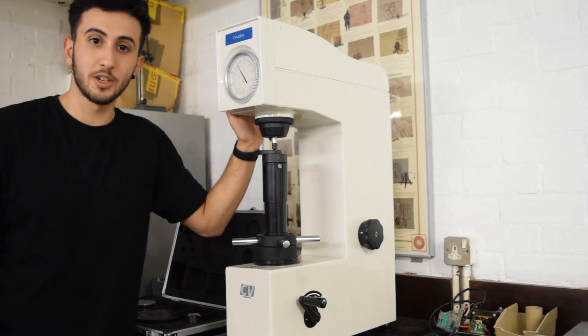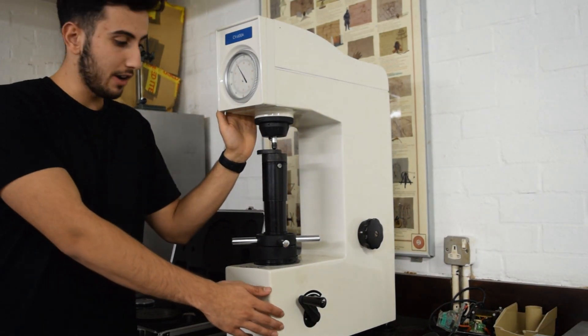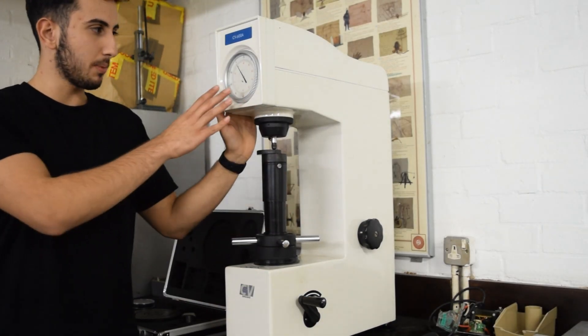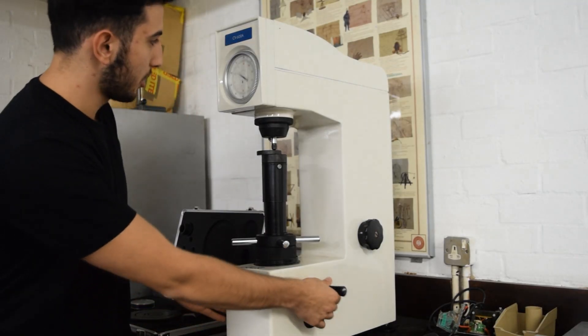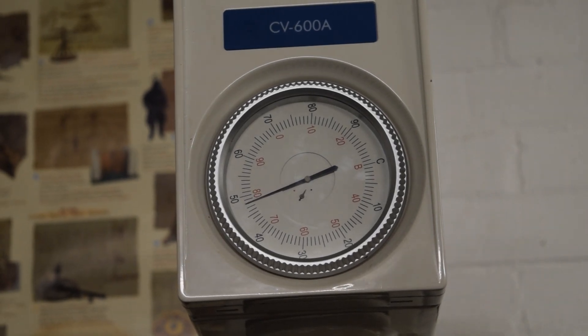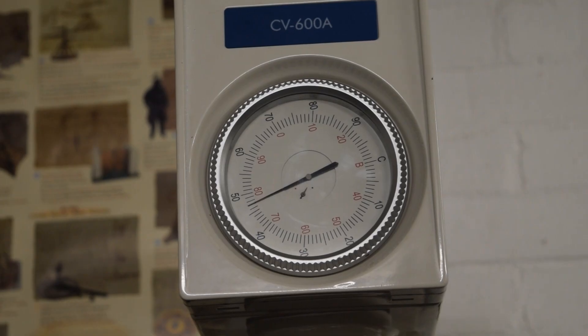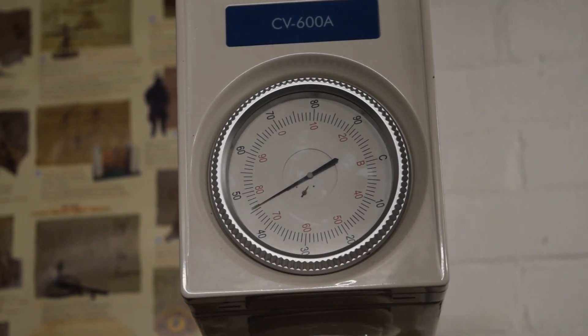This machine is hydraulically controlled, so it's got the major load configuration setting here. Once you've applied and calibrated the dials, you can apply the major load by simply pushing it down. Then you wait for the needle to settle and release the load.